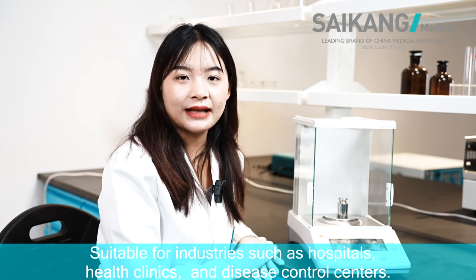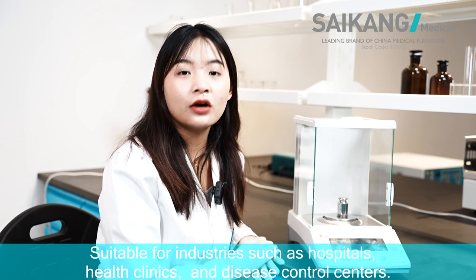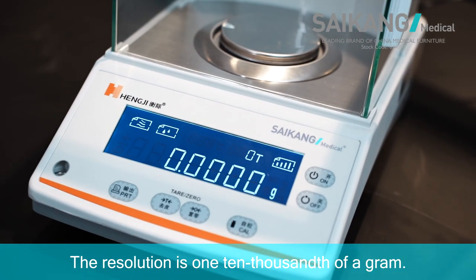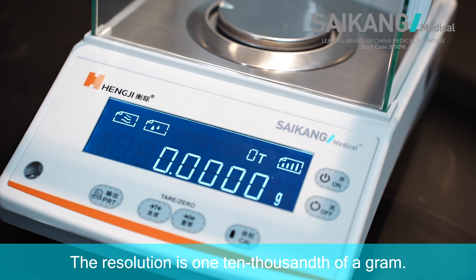Suitable for industries such as hospital, health clinic, and disease control center. The resolution is 1/100,000 of a gram.